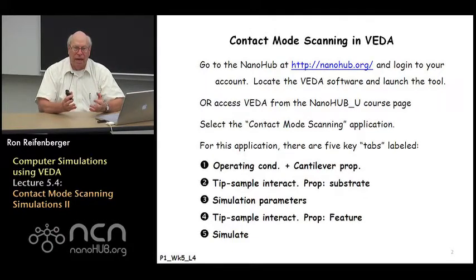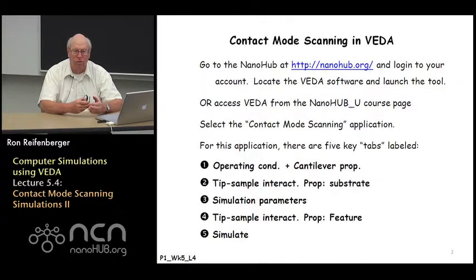Again, let me say there are different ways this type of lecture can be given. We could possibly go through the VEDA tool in real time. I personally did not choose that option. Instead, I've focused on screen captures that have been annotated. So in my opinion, the best way to duplicate these simulations is to print out these slides and have the slides available to you when you go into VEDA and try to mimic the simulations that we're going to perform.